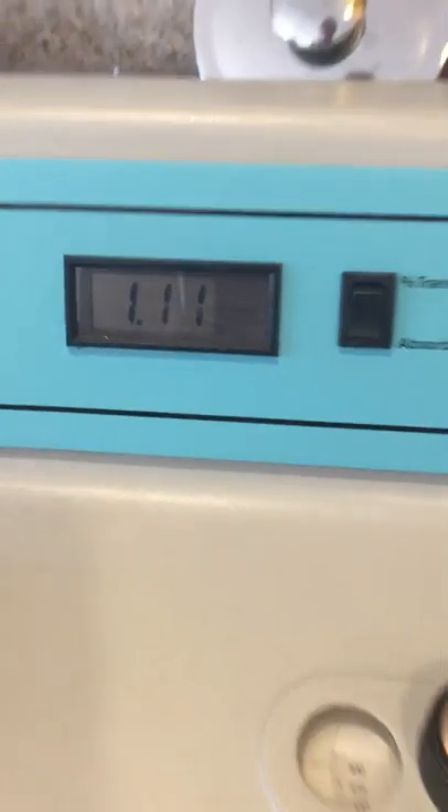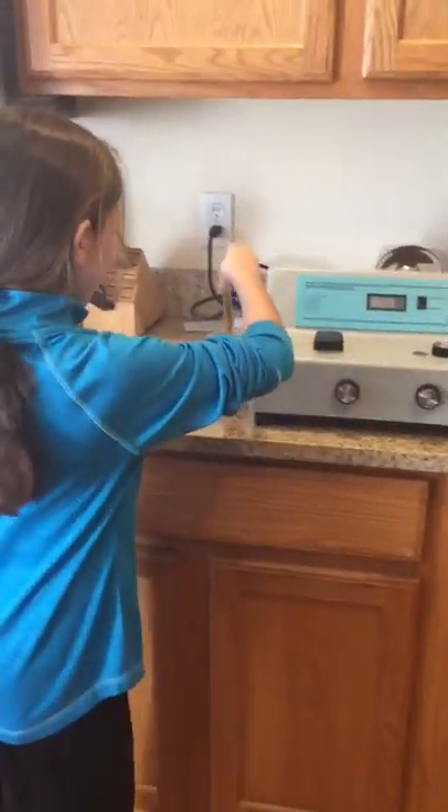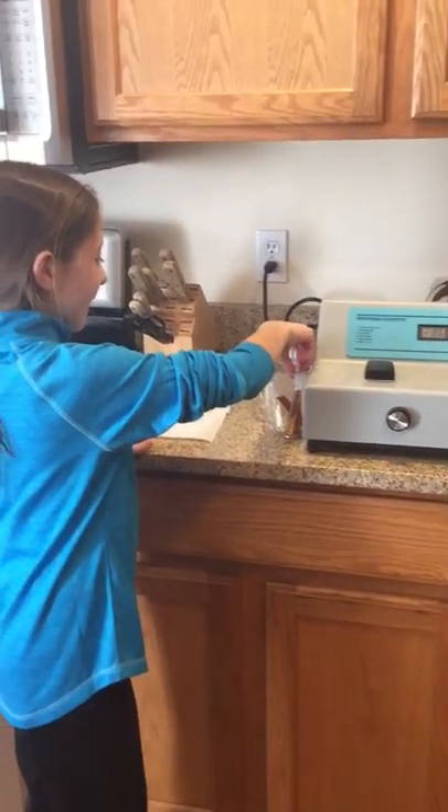And then after that, you're going to take it out and put it back in there.